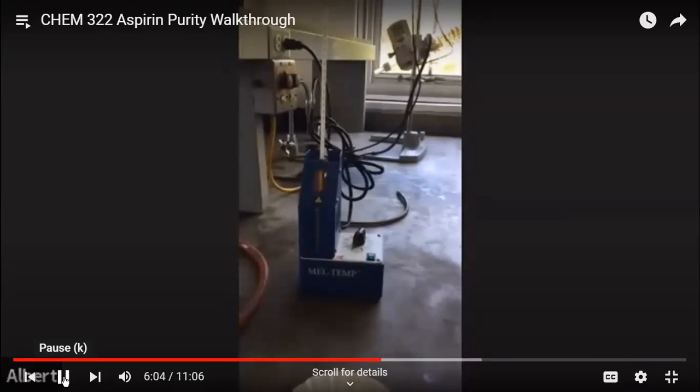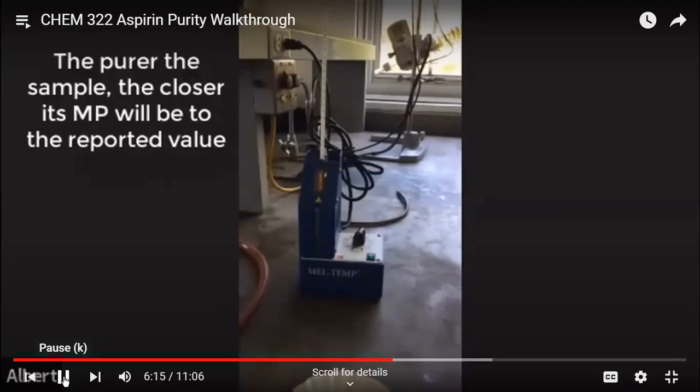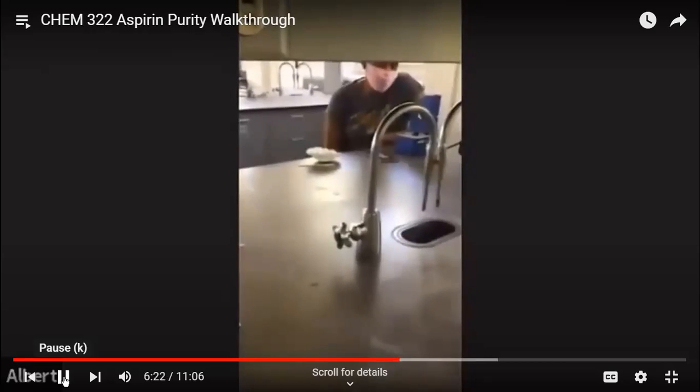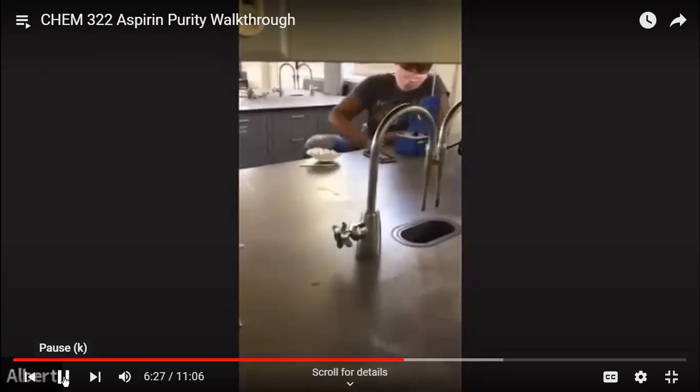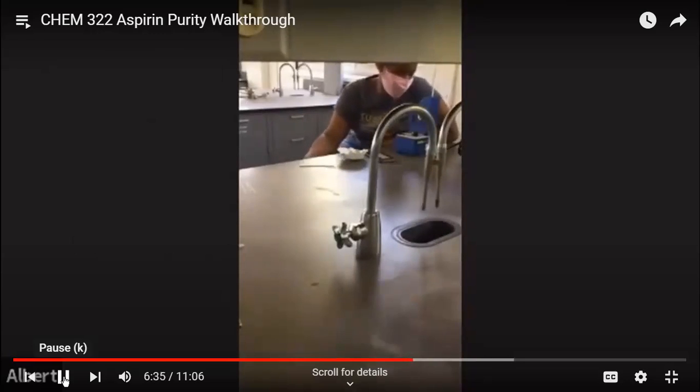melting point. Who looked up the melting point for aspirin? That's Fahrenheit. So about 135 Celsius, right? Okay, so we're expecting 135. We're going to ramp up the melt temp using this little dial right here. It's very rudimentary. We're going to turn that dial to about 4, somewhere around 4 or 5. Don't do it yet because you don't have your sample in. And when the temperature gets to about 115, we're going to turn it down to about 3.5.